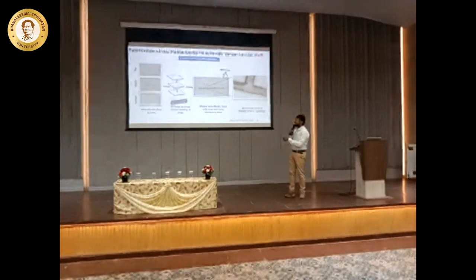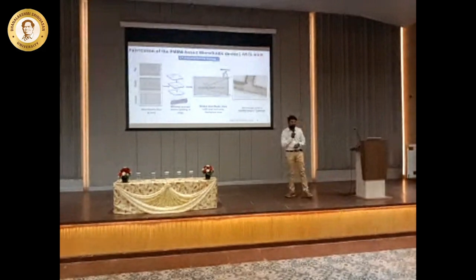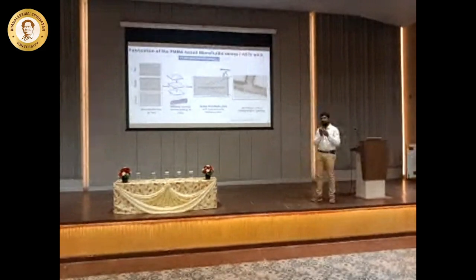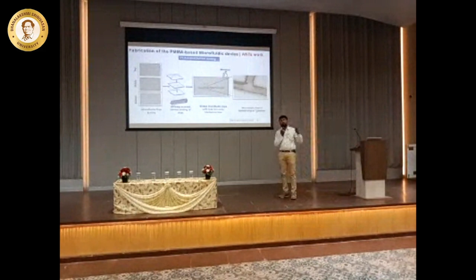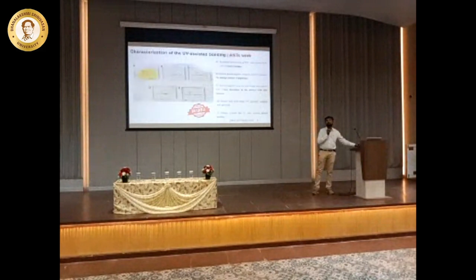So we have created this. It is already known that a UV lamp can be used for creating this binding of these three layers of PMMA. But what we did is we added much more inherent properties, or we changed the solvents that can exactly modify the surface of the first three layers, and then we can fix it, and then we got beautiful structures. I'll show you some. We also optimized these designs. We also changed the different methods. We used ethanol, and we also used acetic acid, and then finally we have come up with a composition of these different solvents to create these beautiful microfluidic devices. And this has been filed as a patent, and provisionally it's still there. So that's why we are very reluctant in giving some information.